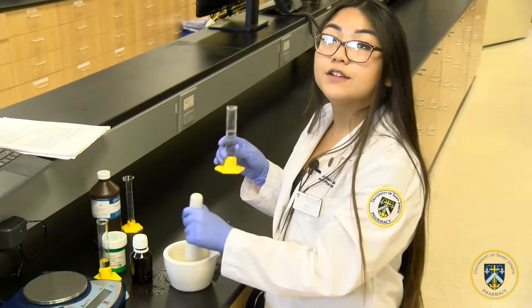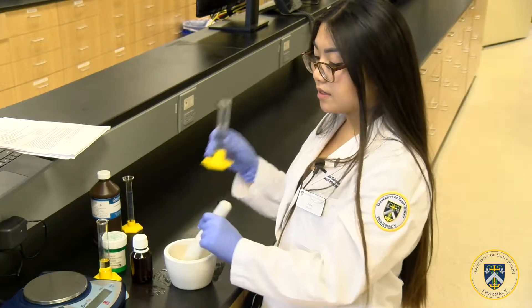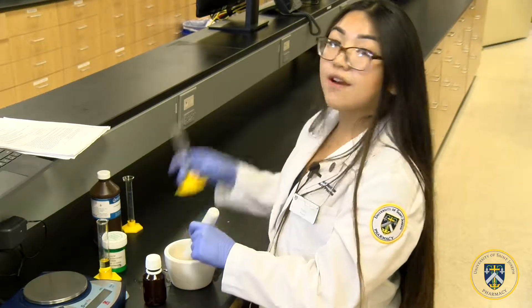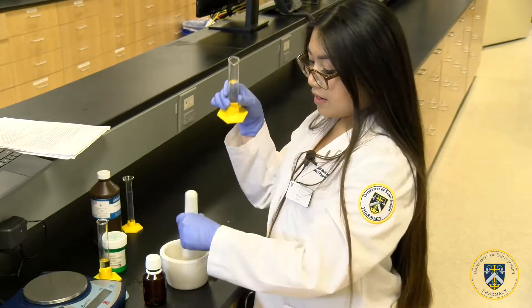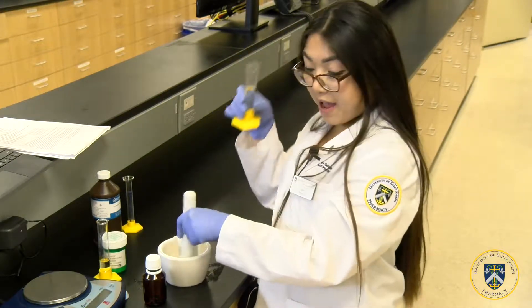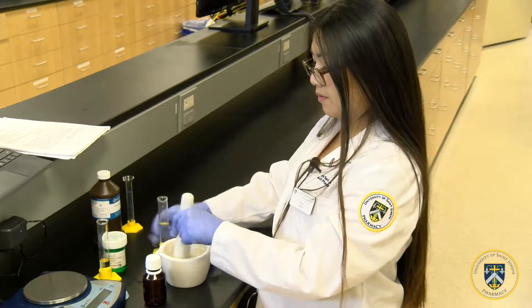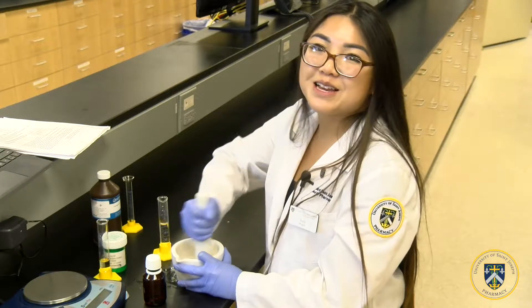Now that you're finished adding all the oil drop by drop, you're going to add quantity sufficient up to 60 milliliters into the amber colored vial. To do so, you have to add water a little bit at a time until you make the quantity via a dilution.